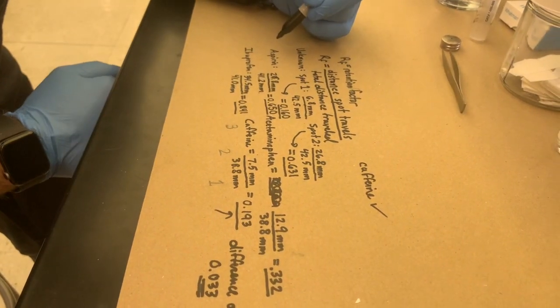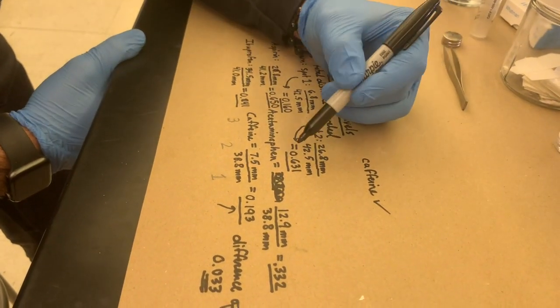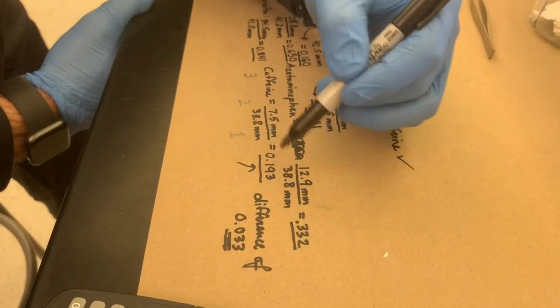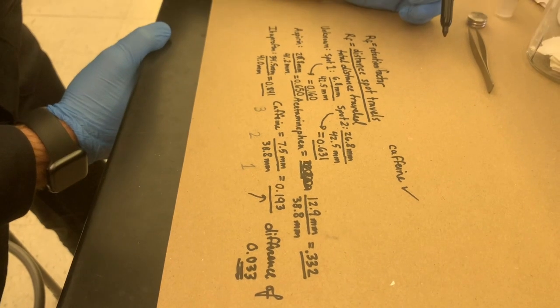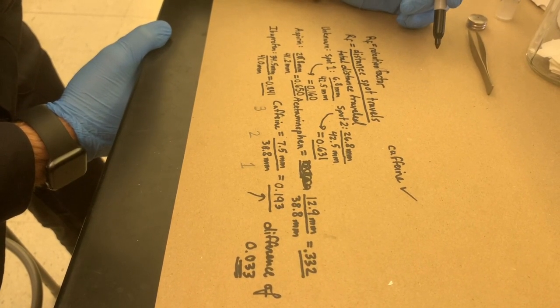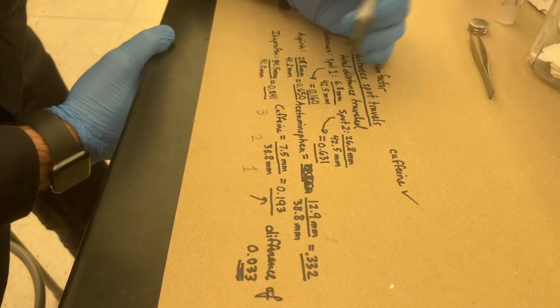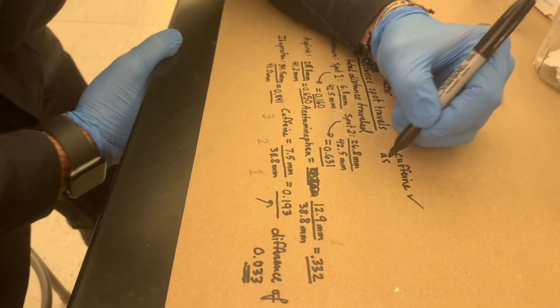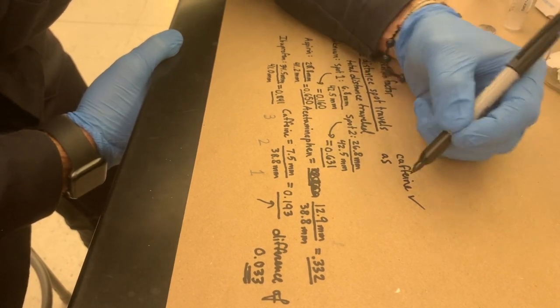And the other unknown is 0.631. Of these 4, which is the closest to that retention factor? If you guessed the aspirin, then you are correct. So aspirin appears to be the other compound in that mixture.